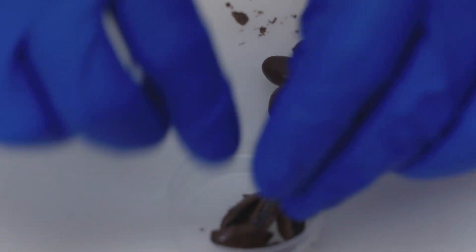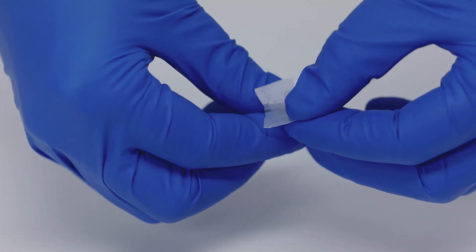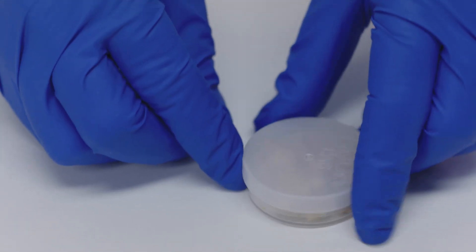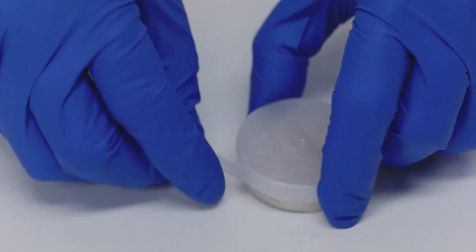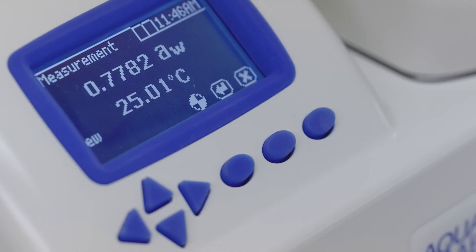Establish a standard operating procedure to specify how samples are prepared and be consistent. Your procedure should include how the sample is handled while waiting to be read and the temperature the sample and instrument should be at during the reading. When you set up this protocol, consider running your own tests to find which preparation method produces the most stable result.